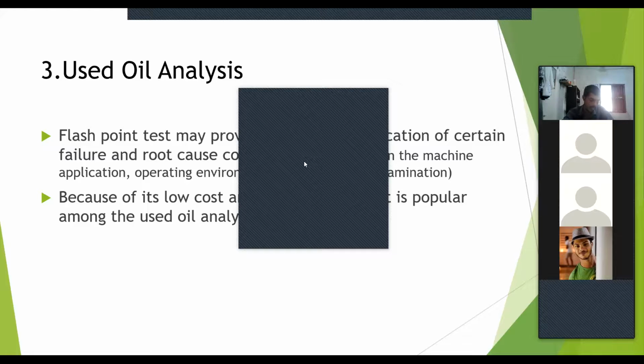Then 058, Mendis. Mendis, are you there? Yes, sir. Tell me what is the range of the flash point? 52 to 96. No, for the petrol. Do you have any idea about the flash point for petrol? Excuse me, sir. Flash point for petrol fuel or gasoline? Below 21. Below 21 degrees Celsius, right?